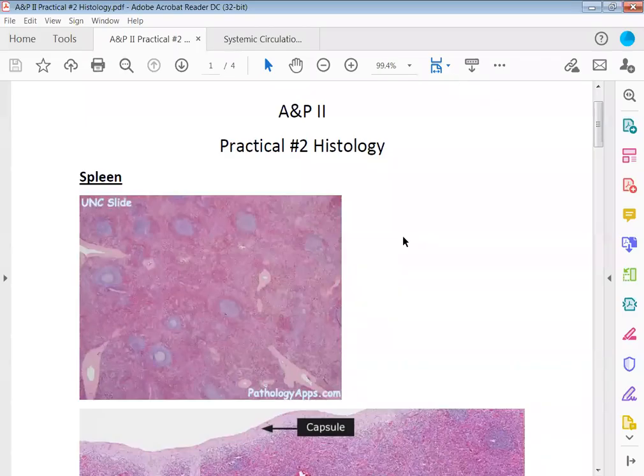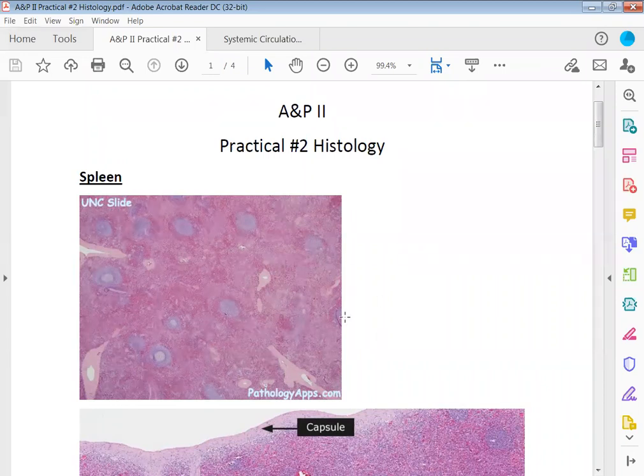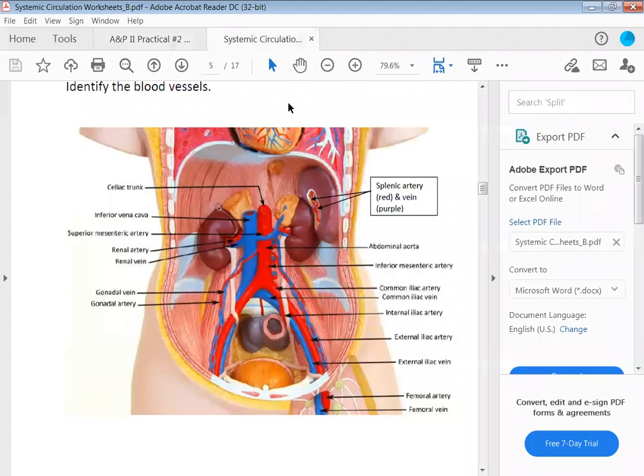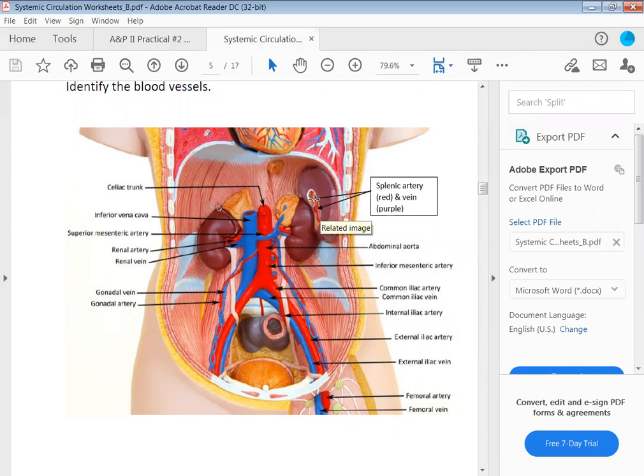Now we're going to cover the histology for practical two in AP2. Before we go into the actual histology, I'm going to show you this image here to show you exactly where the spleen is located in the abdominal cavity. This structure right here is your spleen, located in the upper left quadrant of the abdominal pelvic cavity.